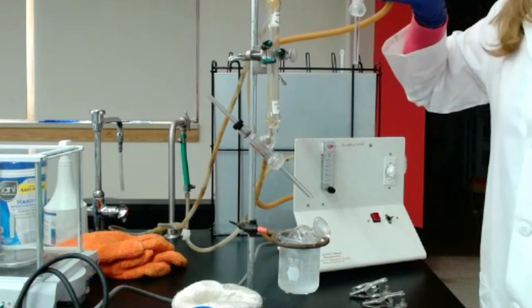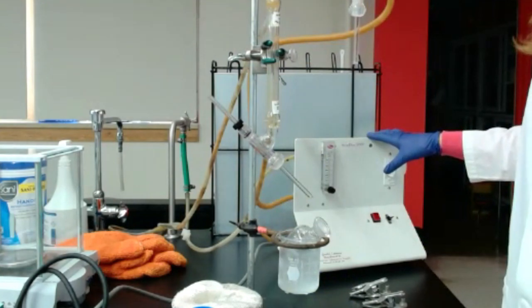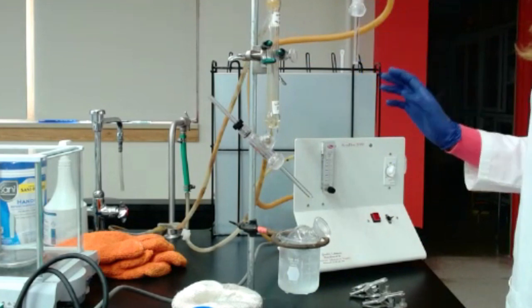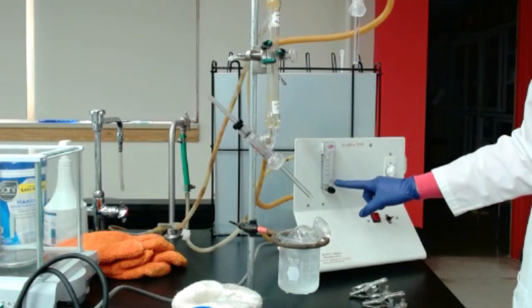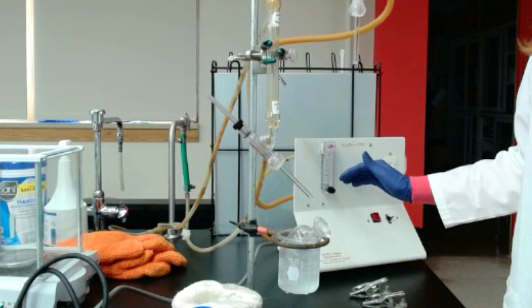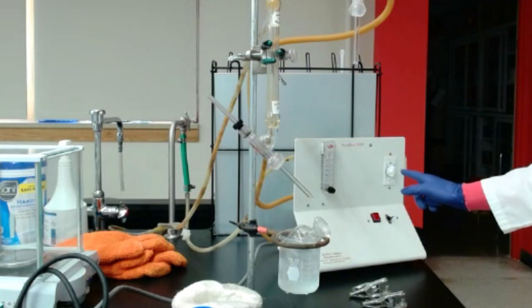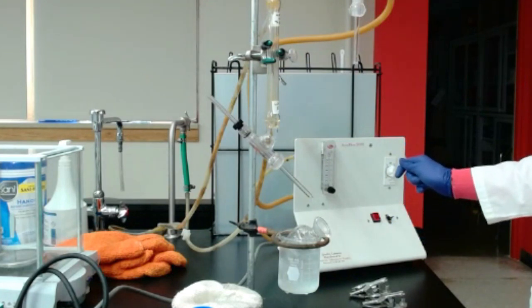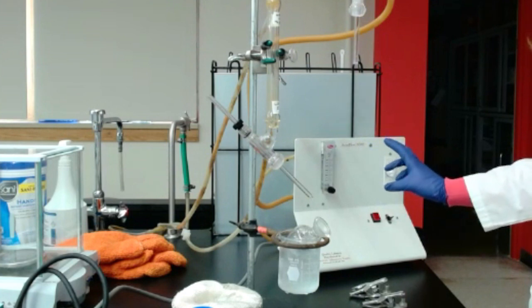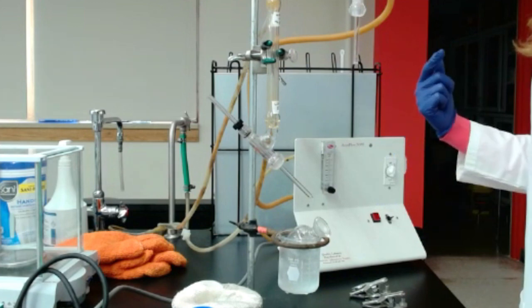And you can see that you also have a tubing here, and that's to connect to airflow. So we have a system that's the AccuFlow. That's just to make sure you have air that is sucked here under a specific flow rate. So this system is going to have a flow rate of 1 liter per minute that you can adjust, but you will need to make sure it's always at this flow rate for accuracy. Also, in our system, we have a timer, because we're going to use that flow for 15 minutes. If you don't have a timer in the airflow system, that is fine. You can use a phone or a timer on the side, just making sure you stay consistent. So you always do it for 15 minutes.